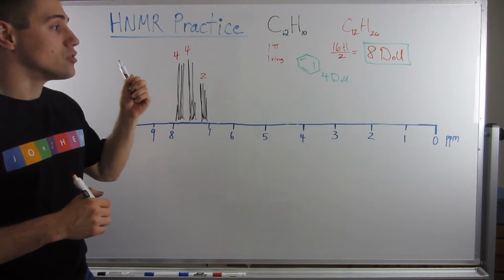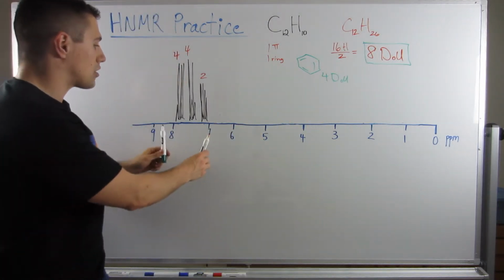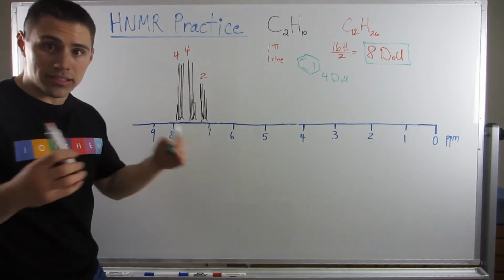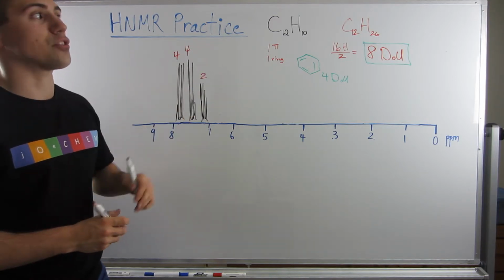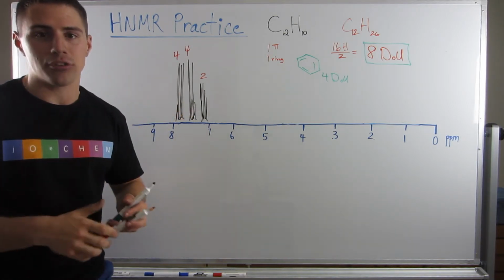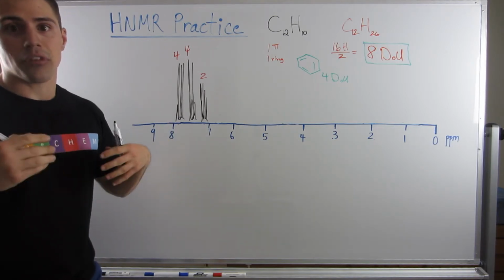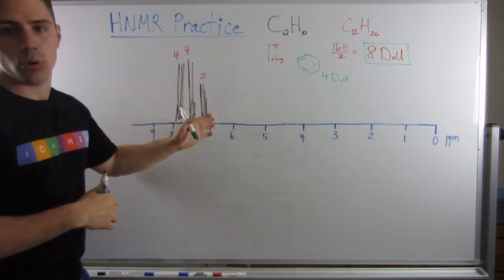And if we had 2 benzene rings, we'd have 8 degrees of unsaturation, and the fact that our chemical shift values lie in this region of the benzylic realm of possibilities, it looks like we might have 2 benzene rings, and that is all of our degrees of unsaturation. So, benzylic H's have very messy splitting patterns. You don't get the really nice triplet or really nice doublet that you do get in the straight chain side of things. So we would even just call these multiplets.